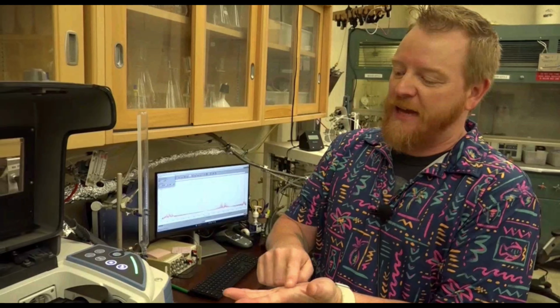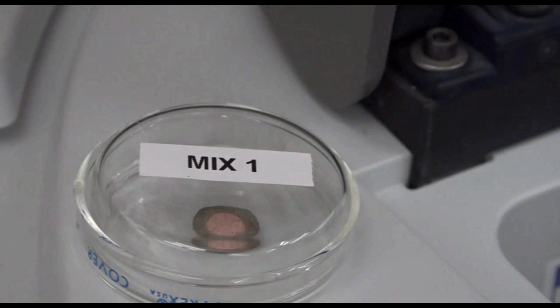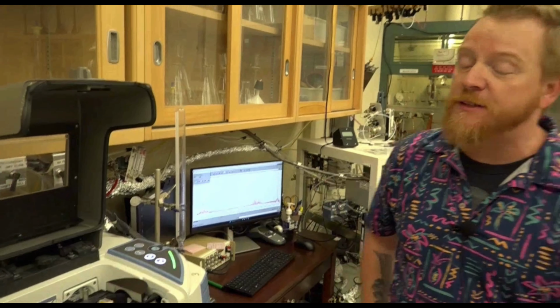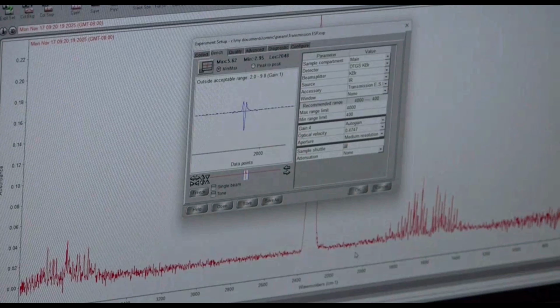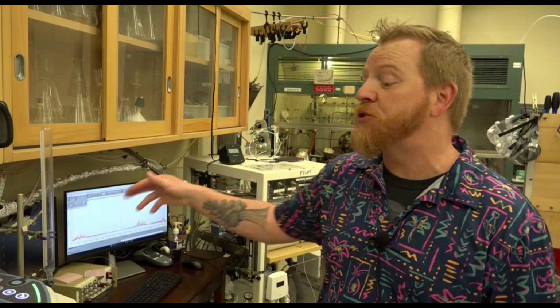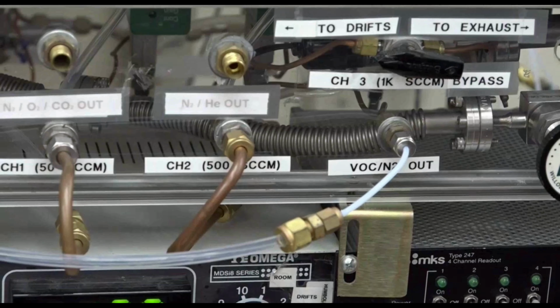So there's a bunch of little tiny dust particles in there, and we flow atmosphere over the surface of those. Because our infrared beam is scattering off of the surface, we can characterize very minuscule changes to the surface of that particle. So we're really doing fundamental studies like what exact conditions do you need to nucleate a cloud just naturally? And then what we're able to do in this chamber is introduce pollutants, so we can see how that influences the cloud formation, and also how those pollutants might get trapped into the surface and travel long distances to other parts of the world that we don't expect them to be.